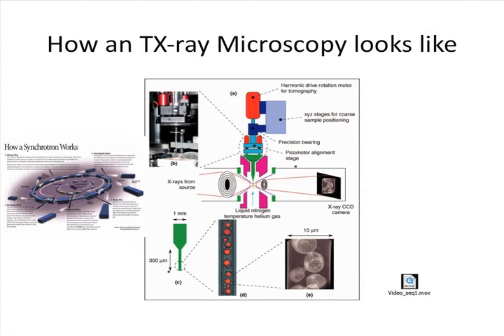I mean, is anybody interested in optics, in how to understand the image formation system of a completely new microscopy? Anybody interested in tomography? How do we invert? How do we do a reconstruction? How do we go from many 2D images to a 3D volume? It is a very challenging mathematical problem. And of course, what are the biomedical implications or applications? Which cells would be interesting to study at a resolution of between 20 and 50 nanometers?